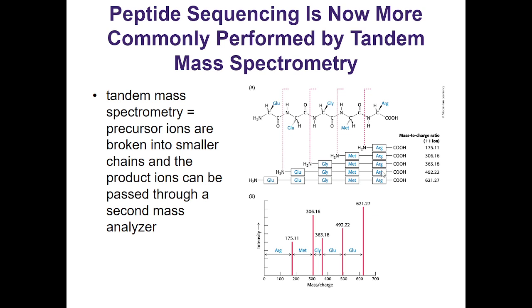So see that we're again breaking them off sequentially. Or we don't even have to necessarily break them off sequentially, but we know that if you have something that has a number in between two different things, it's the one that had one less amino acid, right? Okay, so it doesn't actually matter the order here that this comes out.